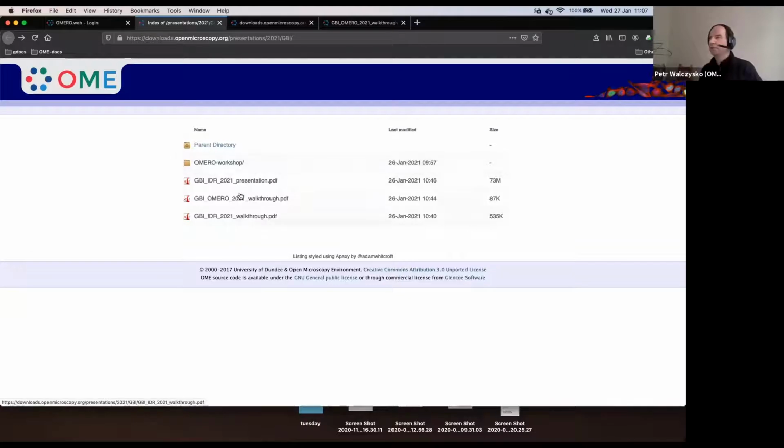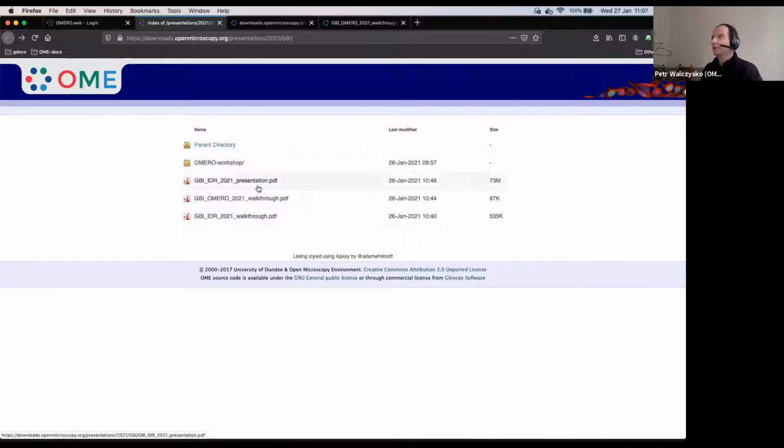So from our perspective, as Gleb already mentioned, we are giving two courses. One today with two parts, as Gleb mentioned, 1.5 hours plus 1.5 hours. Both of those are Omero courses. So you will concentrate today on the GBI Omero 2021 walkthrough for both parts of today. And you will also have the presentation with which I will start now.